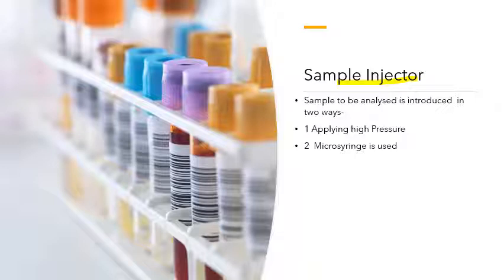It can be introduced by applying high pressure, or a micro syringe is used to introduce the sample. So that's the sample injection system.